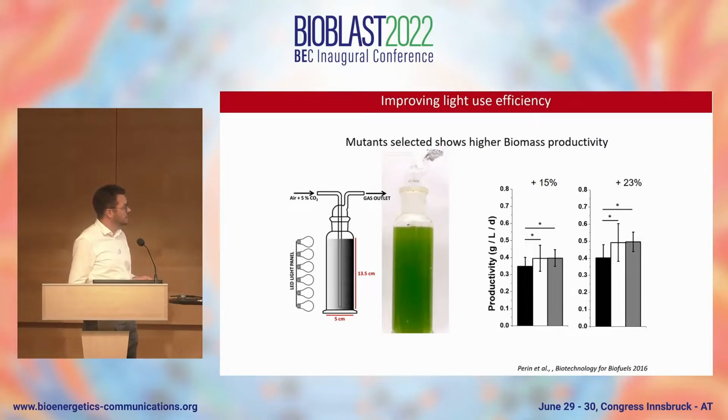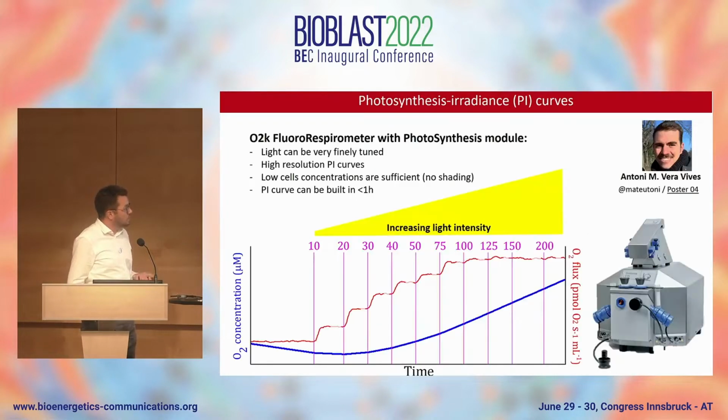in the best cases. So, moving to us, why is it interesting for us to measure oxygen? As we said, oxygen is a proxy for photosynthetic activity. It gives us a good idea of how photosynthesis is working. And so we are testing these new photobiology models, where Tony, who is here, did most of the experiments. So if you have technical questions, you can go to him.